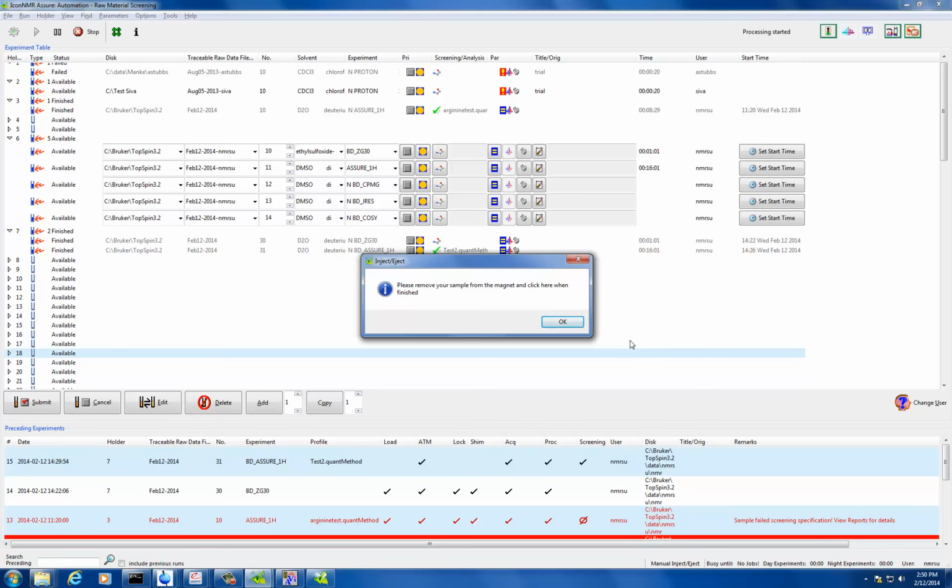One thing you guys also have to decide on, if you are going to do NMR quantification, is what sort of quantification standard you want to use. It can be any sample that you want, and then we can make a method that will quantify that pure sample. From then on, it will make a quantification file, so that any samples run using the same pulse program will correlate that quantification information, and you can start quantifying any other material after.